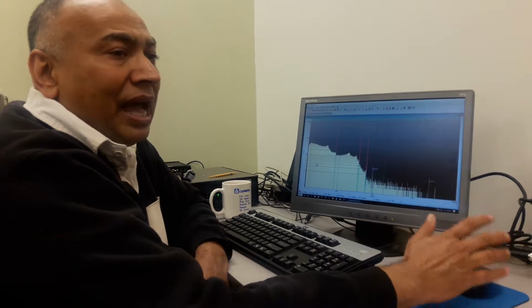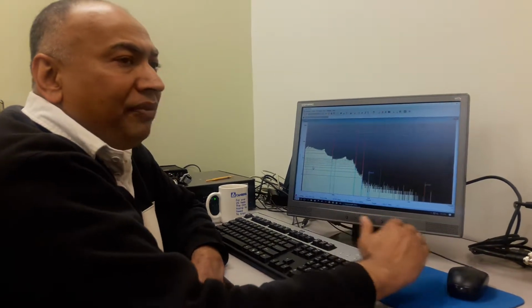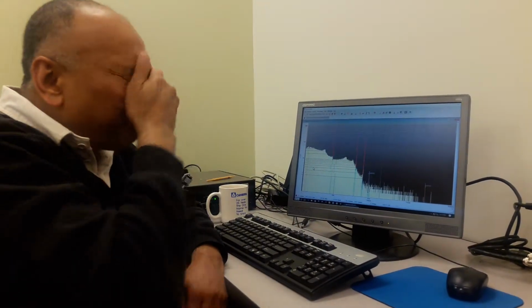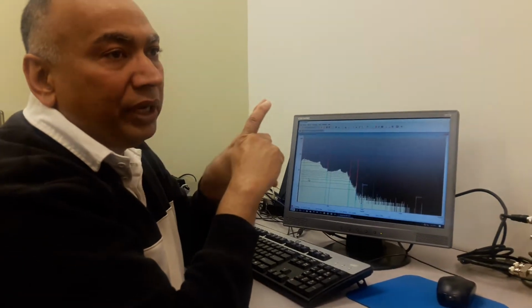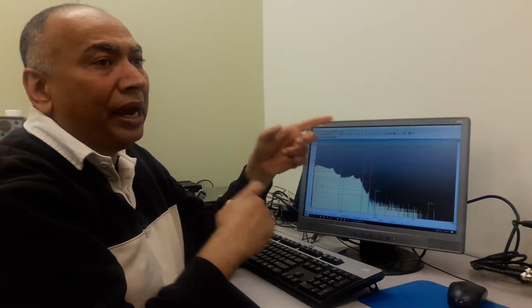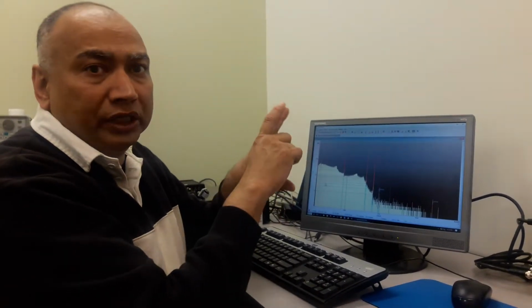But I need to let the computer know how the shape of my peaks varies as a function of energy for this particular detector. So in the future, if I find two overlapping peaks and the full width half maximum value is bigger than what it should be based on my calibration parameters, then the software can do backup calculations on the assumption that there is probably more than one peak in this location.